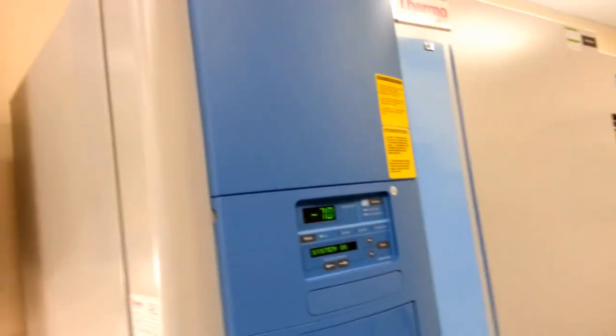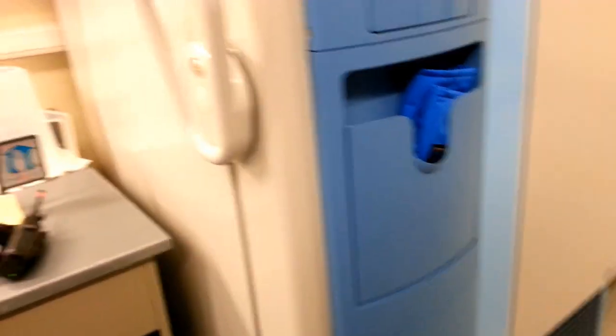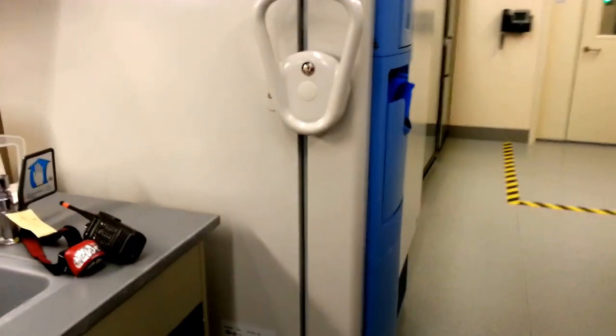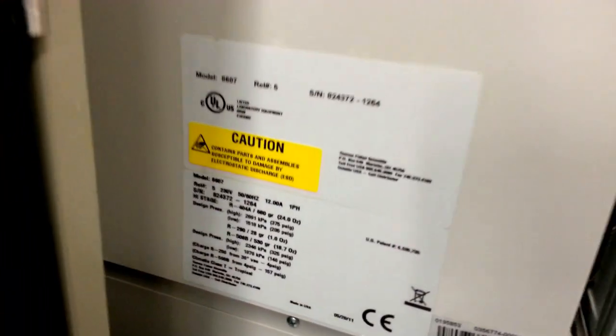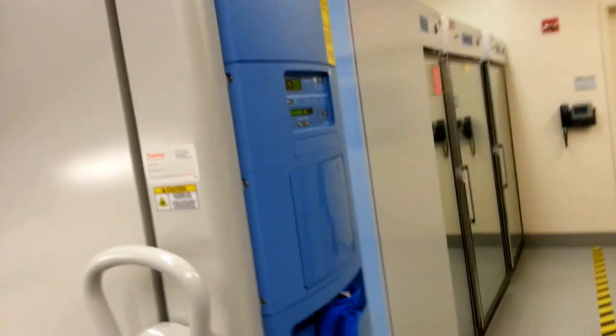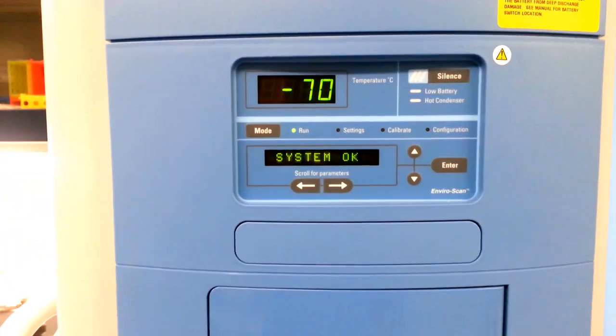All right, this is Eagle Mechanical, or Eagle Tech, or whatever we want to call ourselves. We're going to have a freezer here — minus 80. This might be a 32 cubic foot — basically minus 70 Celsius.